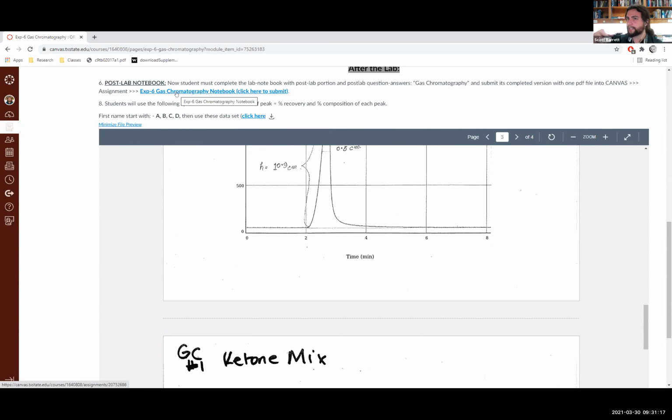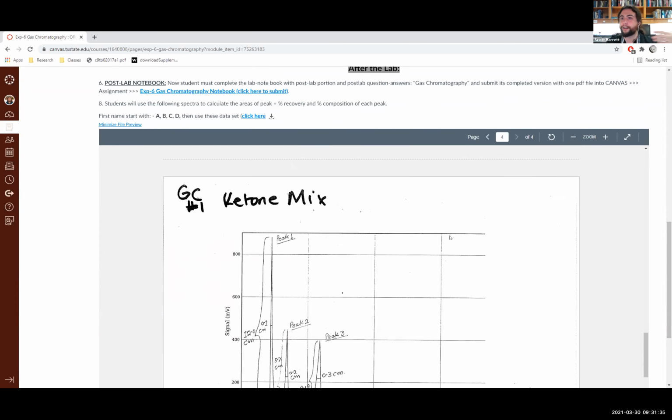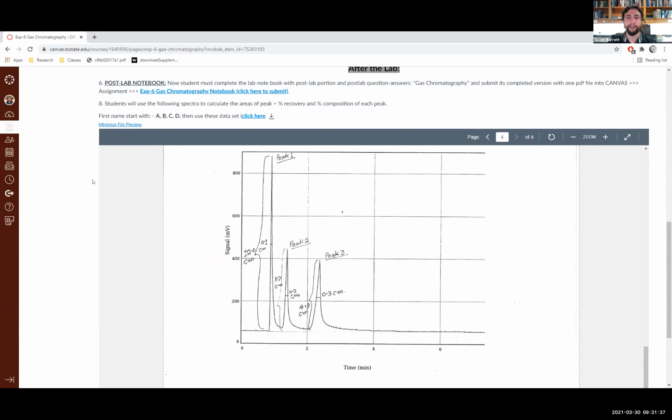So you can start thinking about the molecular weights and understanding where the retention time comes in as a factor, and understanding the concept behind it of why. Why is always the question. And you think about polarity, the volatility, the molecular weight, what functional groups do we have on it? And then that's finally where we conclude our lesson with an overview of gas chromatography.